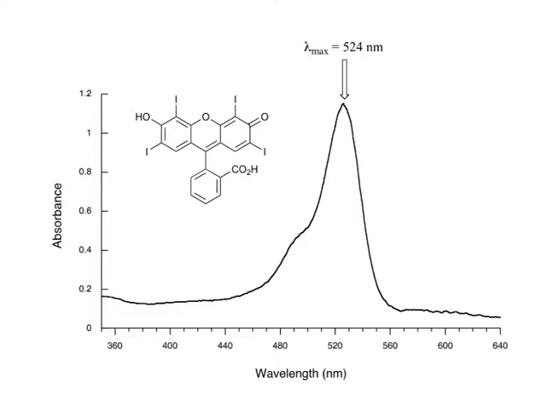The absorption at this wavelength is represented by epsilon max, which represents the maximum molar absorptivity. These parameters are characteristic of a particular molecule.